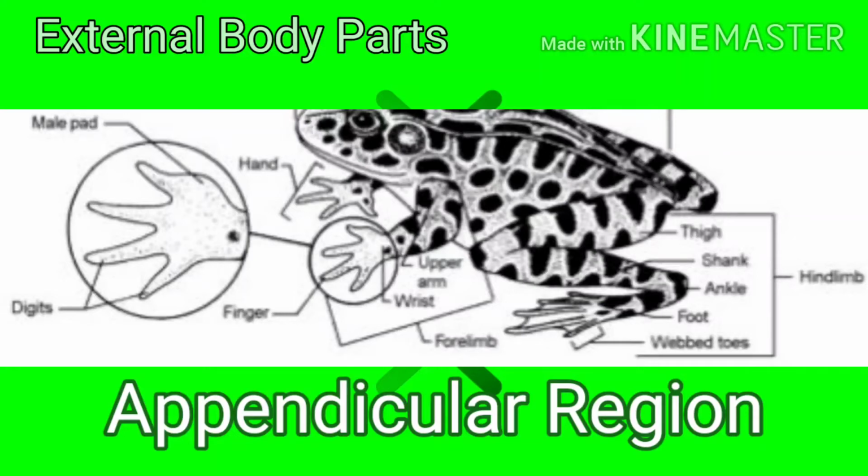The forelimbs are the anterior appendages. Each limb is divided into segments which correspond also with our forelimb. The first segment, which is attached to the trunk, is the upper arm. Next segment immediately below the upper arm is the middle forearm. Next to the forearm is the carpus or wrist. Then distal to the wrist is the manus or hand. And after that are the fingers, also called digits, which are usually 4 in number. And lastly, the prepollux, which is a rudimentary first finger or a short stump on the inner side of the hand.